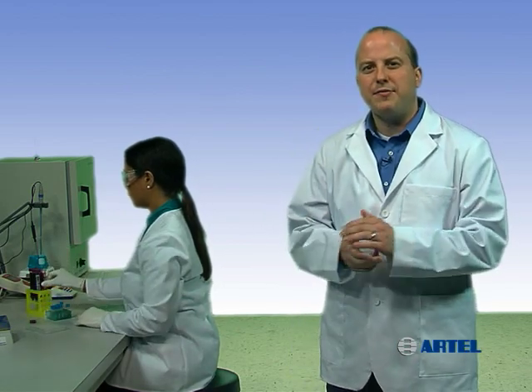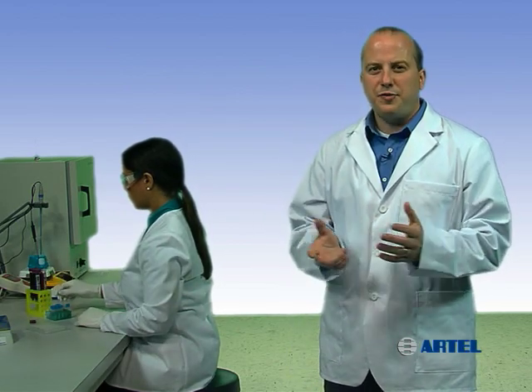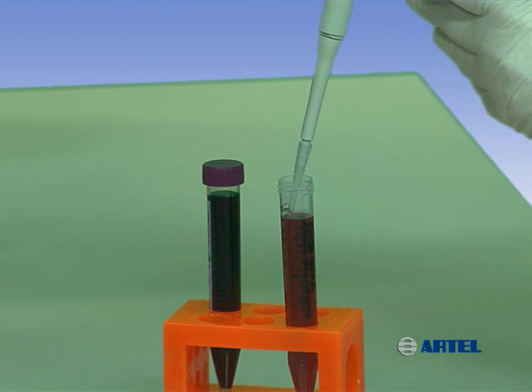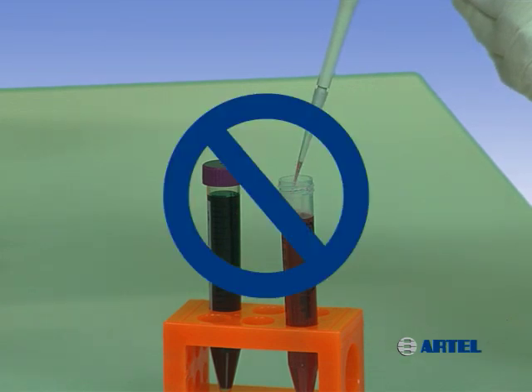This is especially important when pipetting small volumes, such as less than 50 microliters. Surface tension effects may cause sample volumes to vary if the pipette is not pulled out vertically. Varying the exit angle or touching the tip against the container walls may result in wicking or loss of sample as the tip is removed, which could result in lower target volumes.